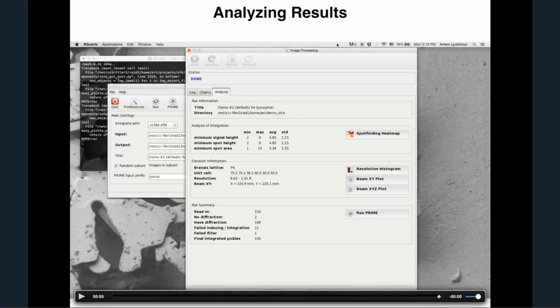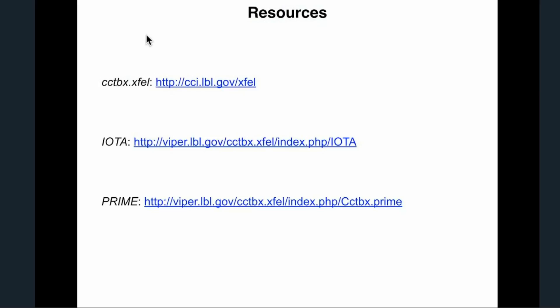That was the breakneck introduction to IOTA. I hope that looked fairly straightforward. For more resources, there is a wiki page for cctbx.xfel in general, with links to IOTA and Prime wikis that can educate you on the details of running these programs. And with that, I'll pass it on to Mona.